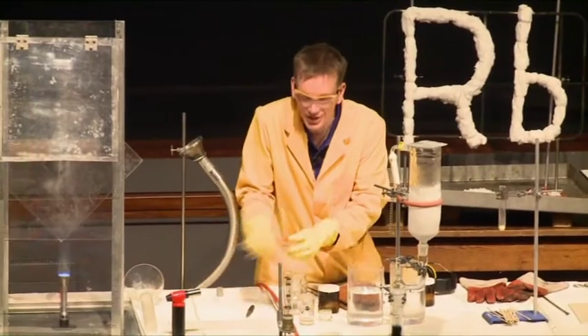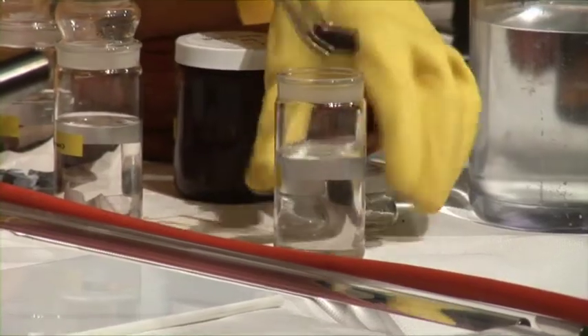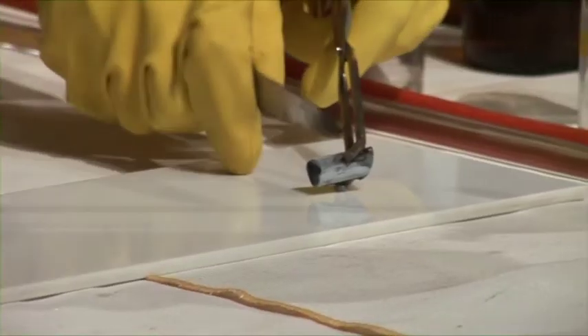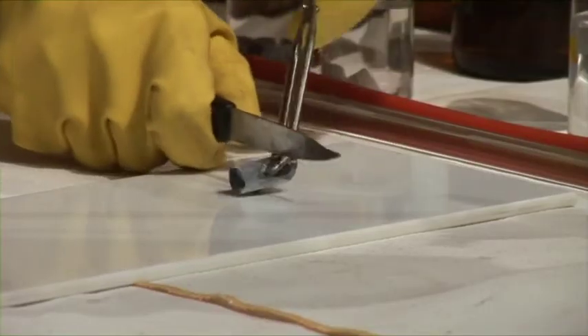I have some lithium floating on some mineral oil, and the oil here is to protect the lithium from the air. But even so, there's a very black crust on the surface of the lithium, and this is actually lithium nitride. So the lithium actually reacts with nitrogen gas.